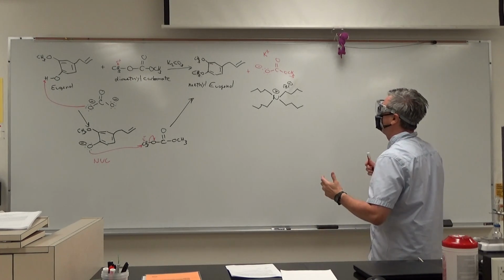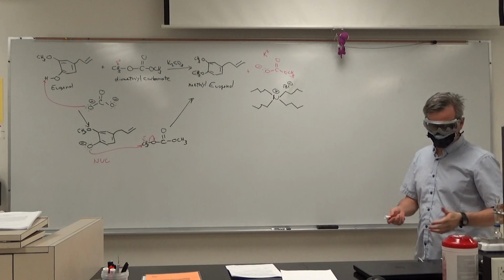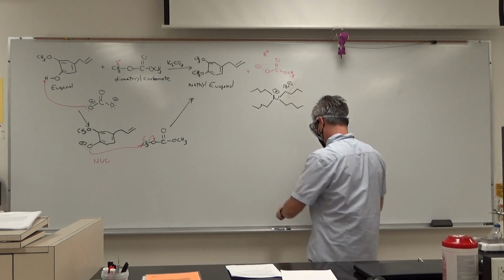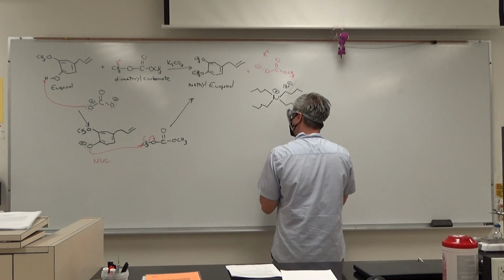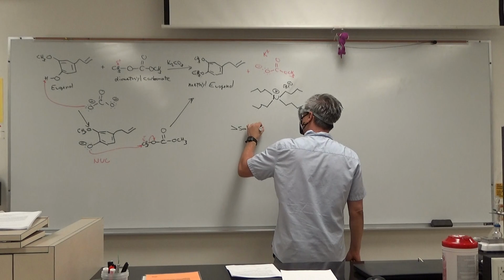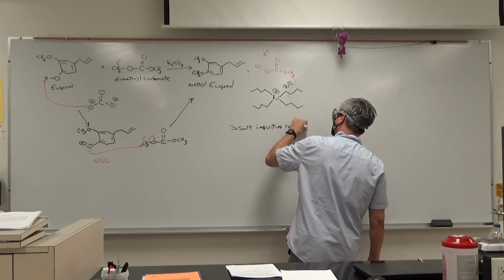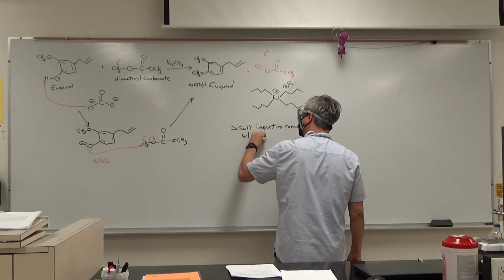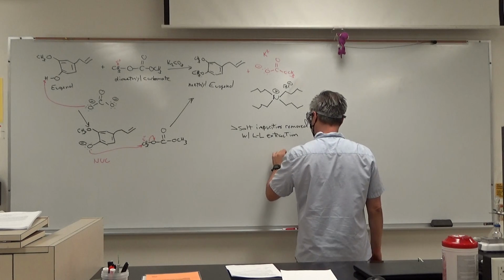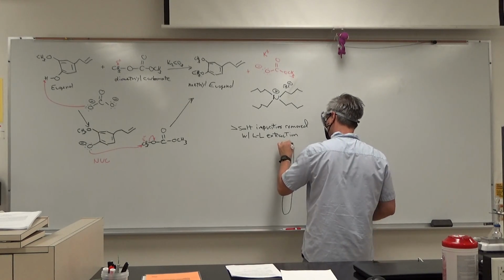At the end of the reaction, you're going to have all this in solution. So what we're going to do to separate it, we don't want this stuff. What we're going to do is a liquid-liquid extraction, just like we did last week. These are all salt impurities. Remove with a liquid extraction. Just like last time, you're going to do it in your culture tube.